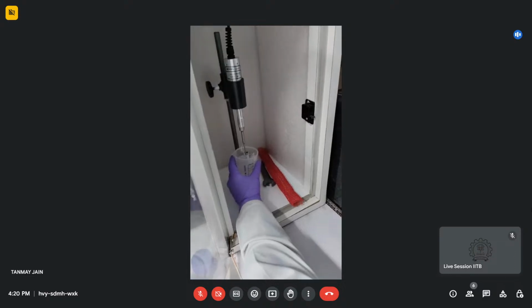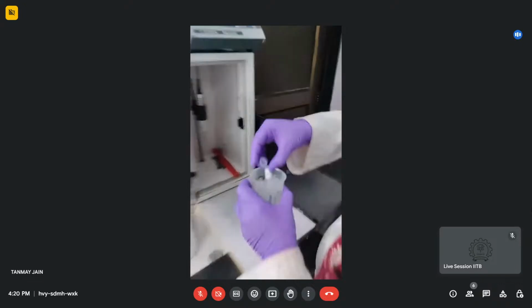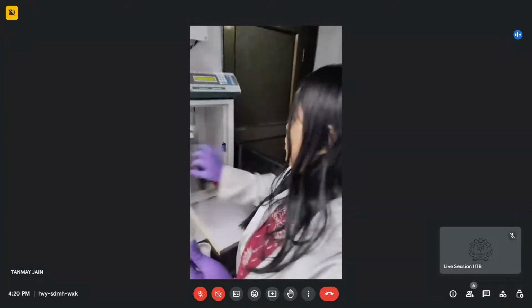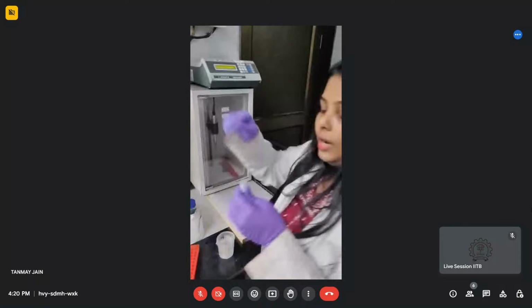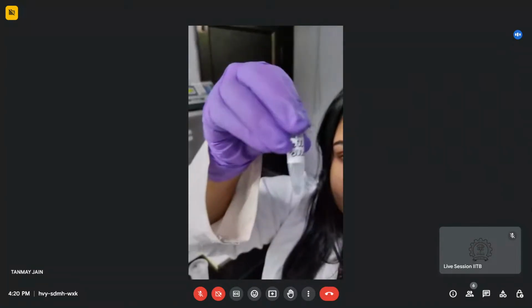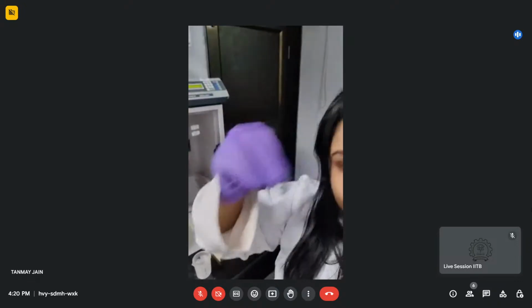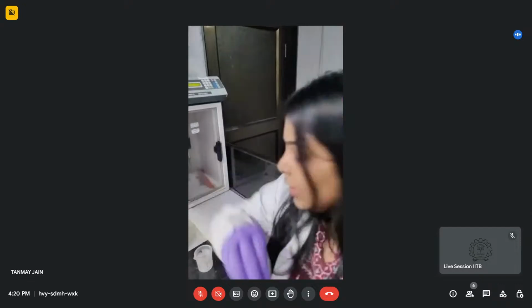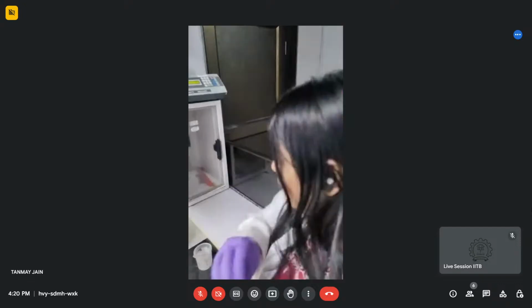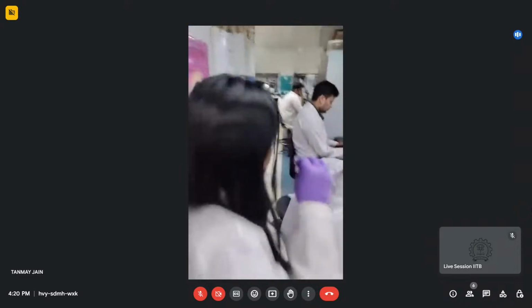Now this will go on for the next 5 minutes, but once the sonication is completely done, we assume that after the next 5 minutes of cycling, you will get a crystal clear solution like that. You have to perform the sonication in multiple rounds until you find a crystal clear solution like that. Once you find a crystal clear solution after sonication, we will do a centrifugation step.